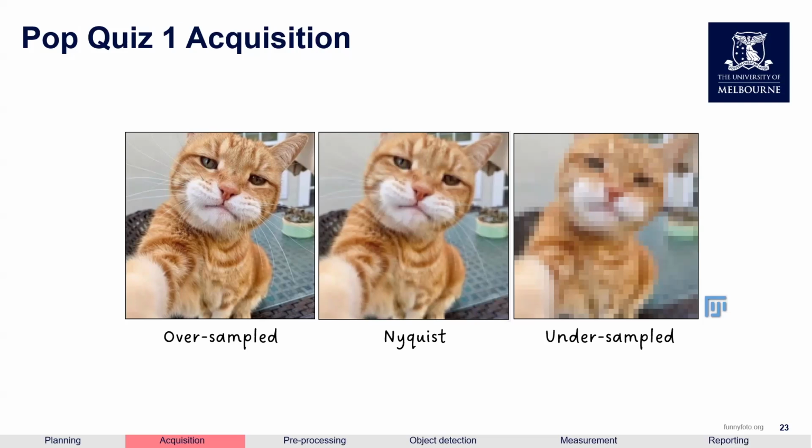And the last one is which format is most appropriate for saving microscopy images for intensity quantification? Yes, most people have selected the right answer, which is a raw file format. In Fiji and many other specialist software that deals with microscope images, you should be able to open these raw file formats and access all the data fine. The standard TIFF, as I mentioned, a lot of people still use it, but be careful because it may have removed all of your metadata.